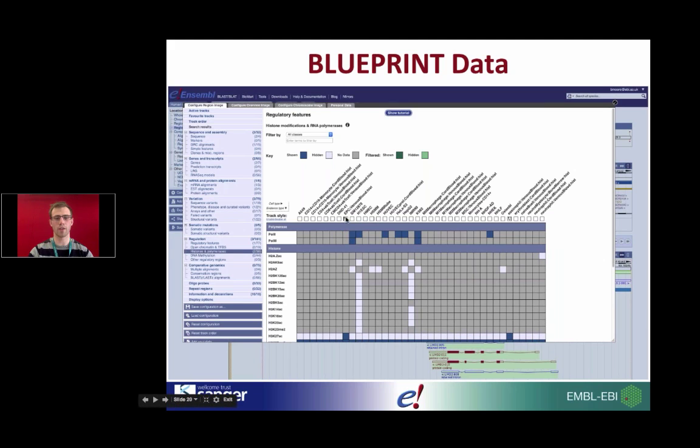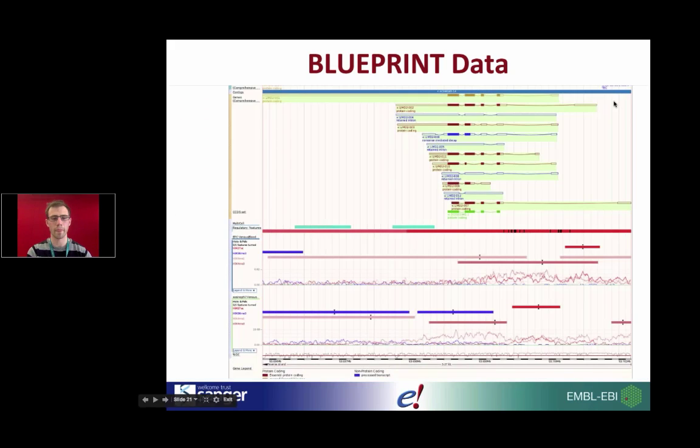As you can see here now, I've turned the data on for both the EPCs and the eosinophils. All of the data relating to these cell types has been added, and I've set the style to both peak and signal. I can add these tracks by clicking the tick in the top right-hand corner. As you can see, even more data has now been added to our region in detail view.